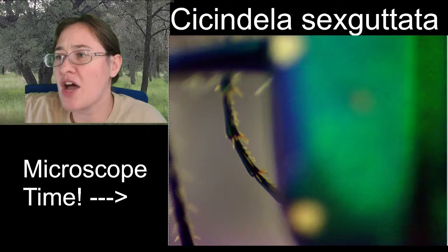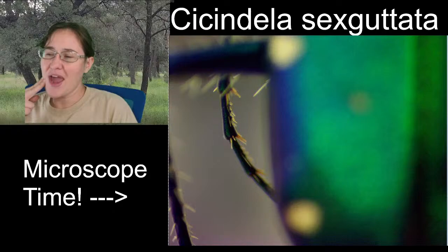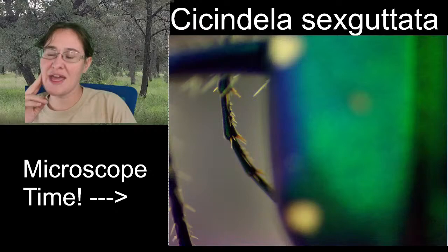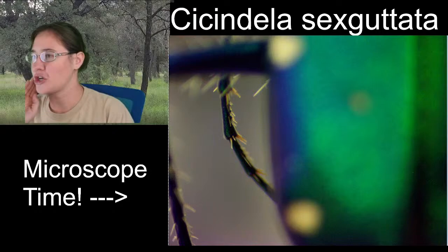I'd call those spines, but they look more kind of yellow rather than sclerotized. They don't look like the dark blue, dark green color. They look like that lighter color. So rather than calling them a spine, I would probably call those bristles. It's probably kind of a difference. These look like they probably have a joint at the base of them so that they can move like a hair would, rather than a spine. A spine a lot of times is straight and isn't mobile, so it's not turning or moving a lot.